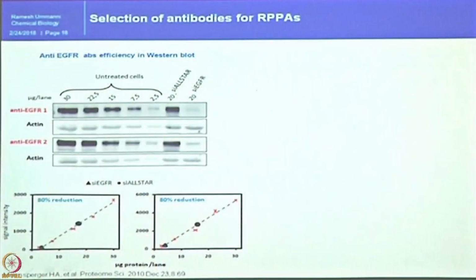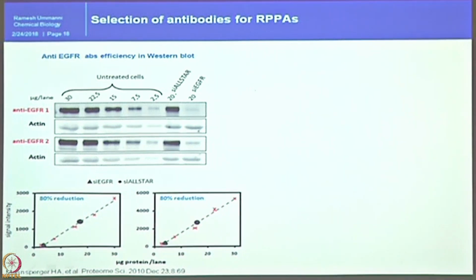At this point, to educate you in a different way, not all antibodies against one target will behave the same way. Let us say, for example, if you search the Cell Signaling website for an EGFR or phospho-EGFR antibody target, you will find 10 different antibodies with different catalog numbers. That means they are from different clones or different monoclonal antibodies, and not all the antibodies behave in the same way. How is that? Now, look at this picture.